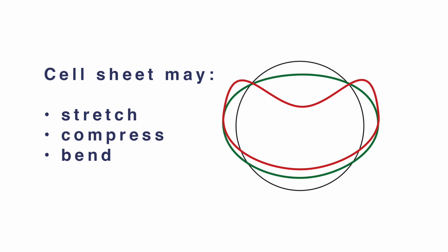We have seen the observed area of the pushed ampulla is increased during compression, which would be expected as it is flattened. However, the area of the partner ampulla actually becomes smaller, implying its volume becomes smaller, presumably because, counterintuitively, the volume of the pushed ampulla becomes larger by the push. If you look at the video of the push carefully, you can see cells flow into the pushed ampulla.